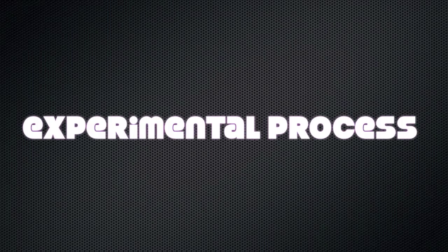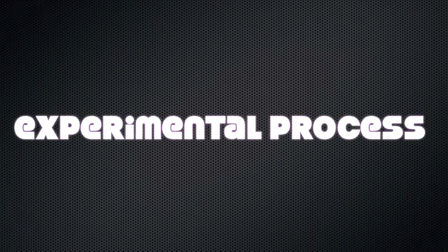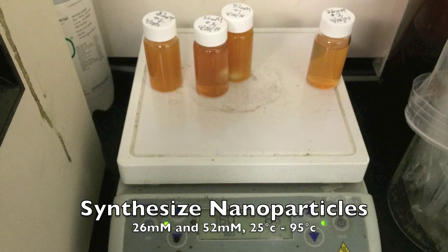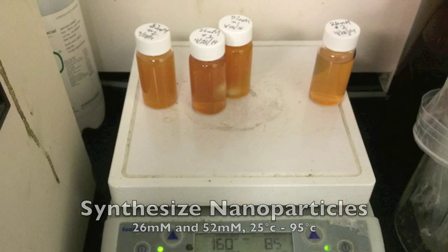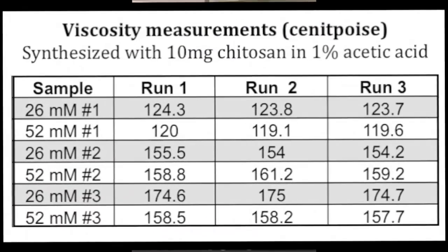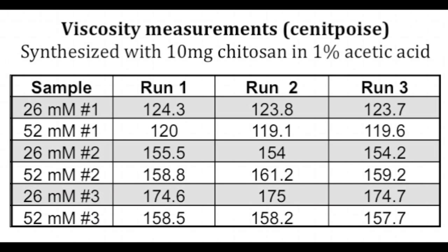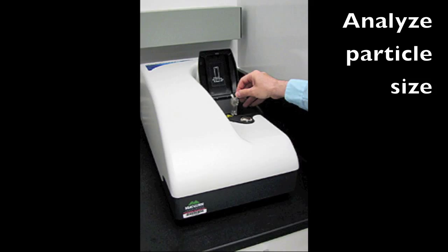This part of our video will cover our experimental processes and the data that we acquired from doing them. We synthesized our nanoparticles with two different concentrations and a range of temperatures. We then analyzed the solution for viscosity, trying to determine if nanoparticle size had any effect more so than the concentration of chitosan. It was discovered that the stirring of our solution actually lowered the viscosity more than anything else.